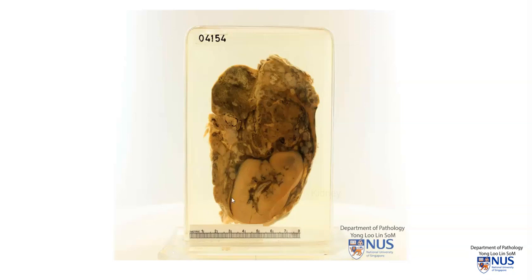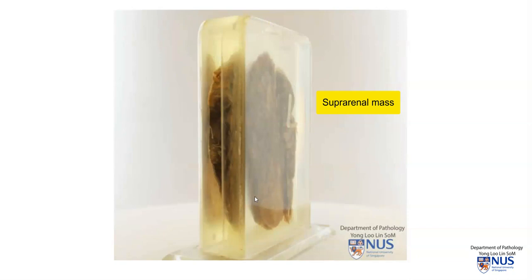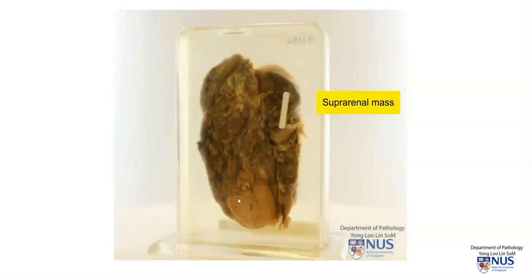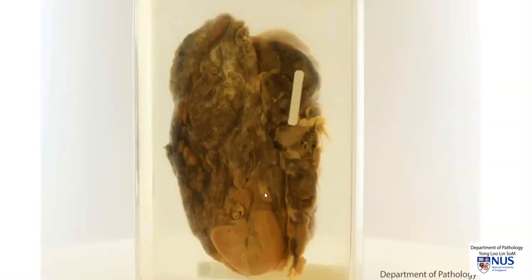Here is a specimen of a kidney that has been bisected with some surrounding tissue. We can see that there is an extremely large, very ill-defined mass superior to the upper pole of the kidney. Turning the specimen around, we can again see the kidney, which is quite sharply demarcated from this mass.